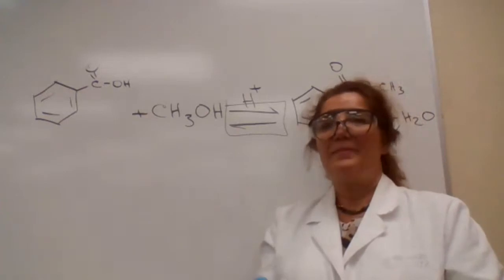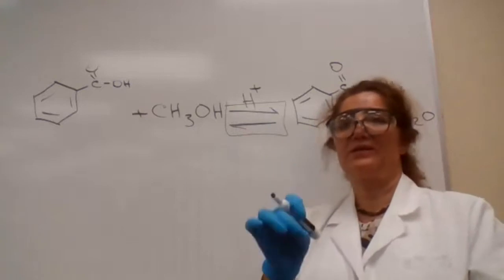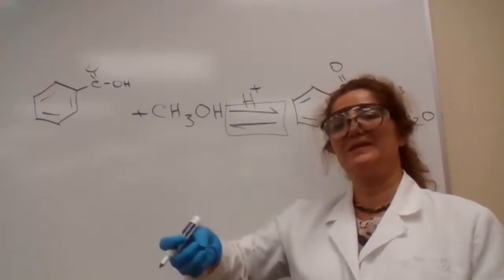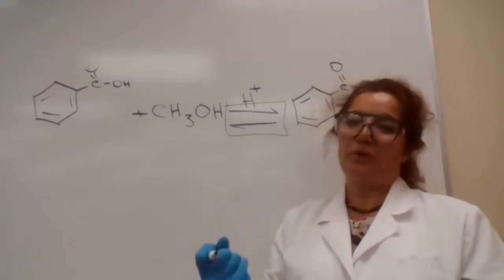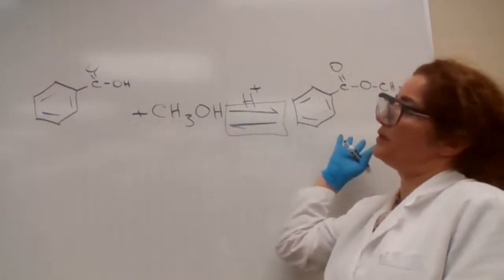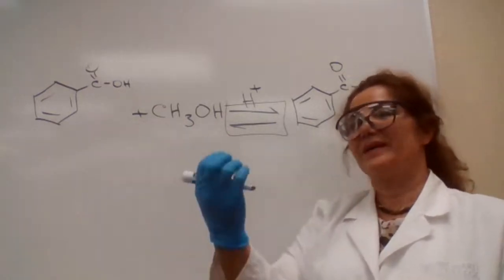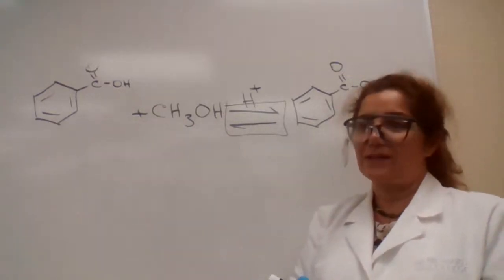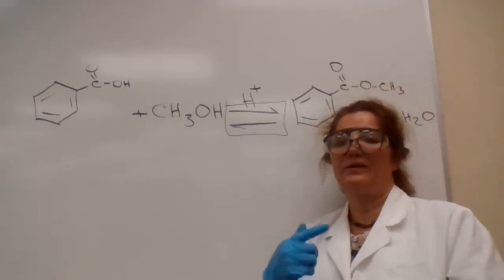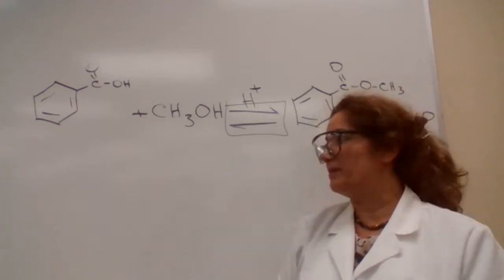They are very clean because they don't react with our chemicals. You just put them as small beads inside your flask. When you are done with the experiment, you get swollen, larger beads. You take them out, and they have absorbed the water. So when you reach equilibrium, you can push the reaction toward the formation of product by removing water. As the water is being produced, it gets absorbed by the silica gel beads. They are stable enough that they don't react with our chemicals at the given temperature.